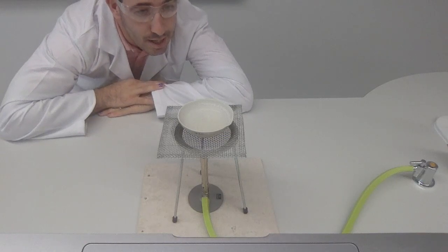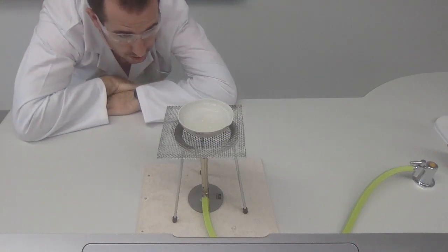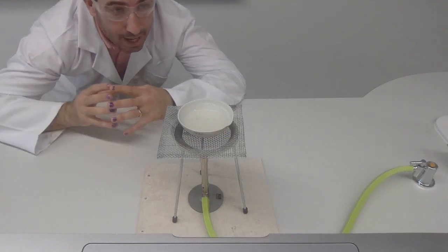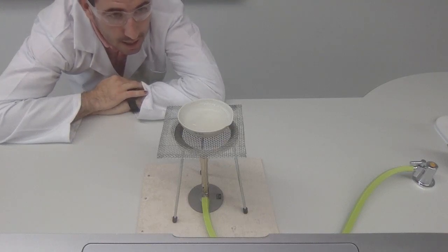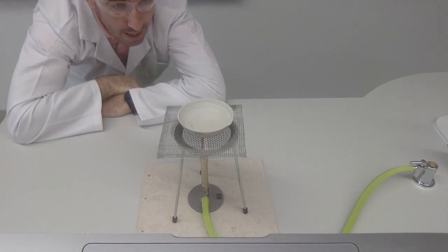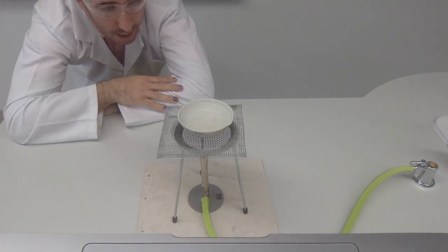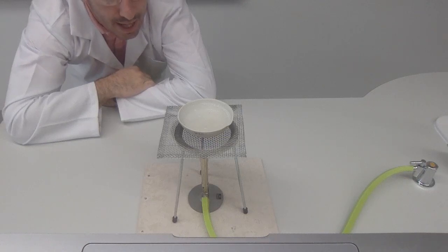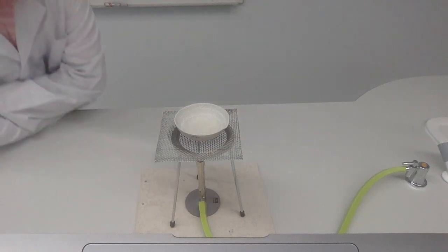So it's looking quite good, isn't it? As you can see, the water level is getting lower and lower. That is because of evaporation, where the liquid molecules are separating from each other, getting lots of energy to change into a gaseous state. We can see some of the steam coming off the top. You see the bubbling happening, and the bubbles are part of the gas that's being formed within the liquid itself. So we can see that it's still bubbling, still getting there. It's almost there. Look at all the bubbles.